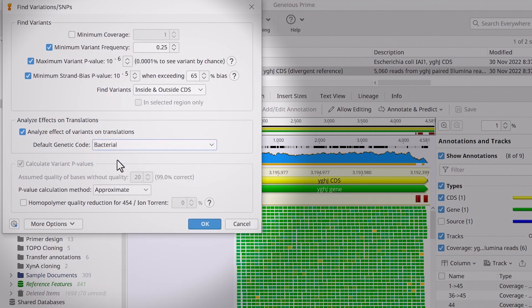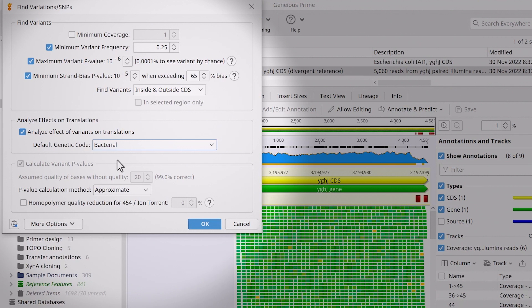Selecting to analyze effects on translations means Genius will use the coding sequence annotations on the reference sequence to determine the coding sequence of the mapped reads. Genius then calculates whether the observed SNPs will result in a change in the amino acid sequence.